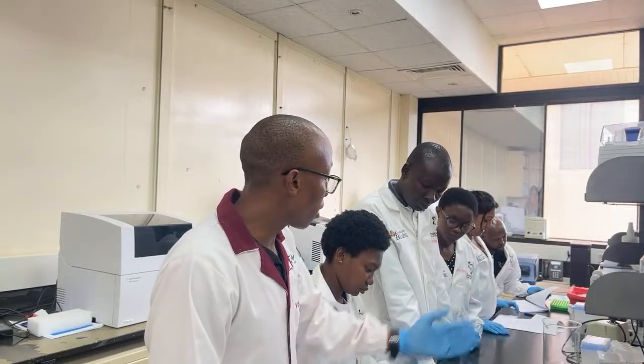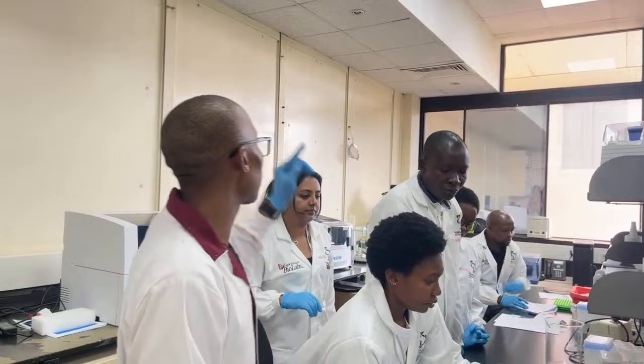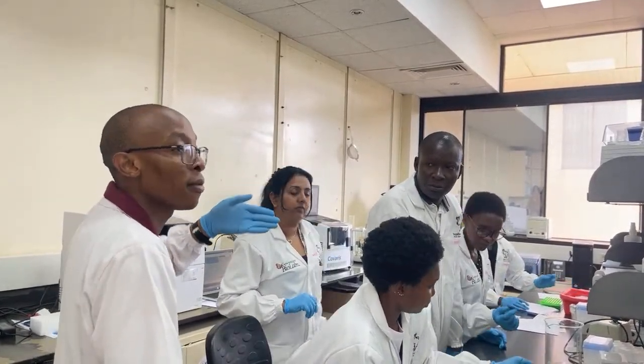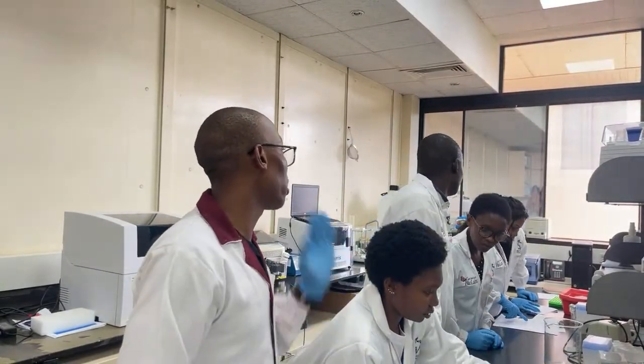So everybody can take their tubes, and then the centrifuge must be set to between 18 and 25. So you can set it at 20.